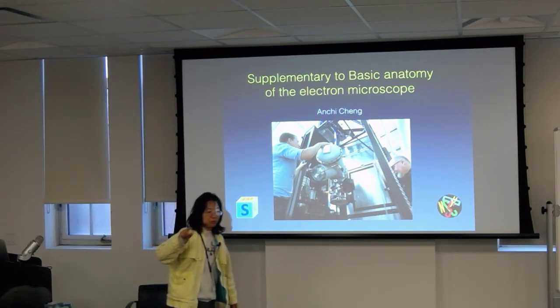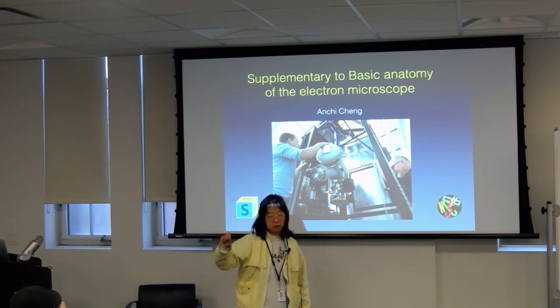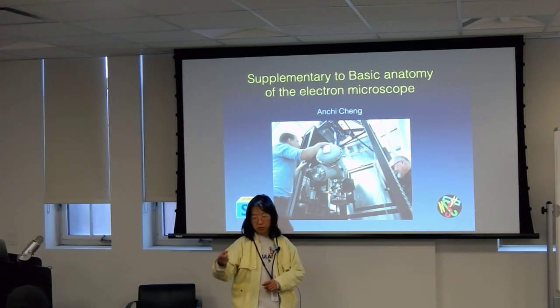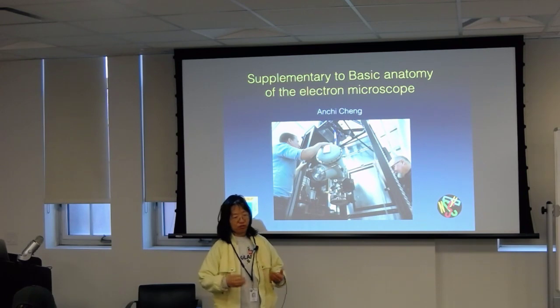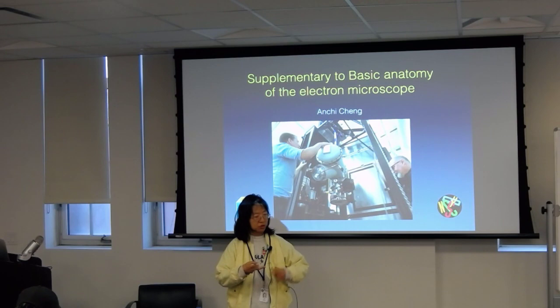So in this, the main component in there is an objective lens. Okay, so they made it out of plastic to have that lens in there. And then there are all sorts of things related to exactly what you learned in your lecture, with aperture and stuff like that. There are things that you need to use to get your focus better. And once we start to learn the Fourier transformation and the image formation, you're going to see things in there.